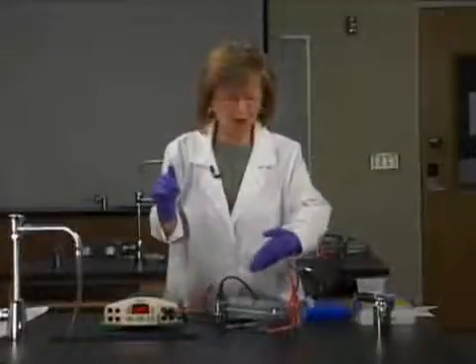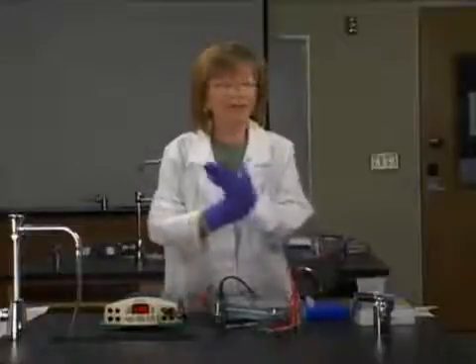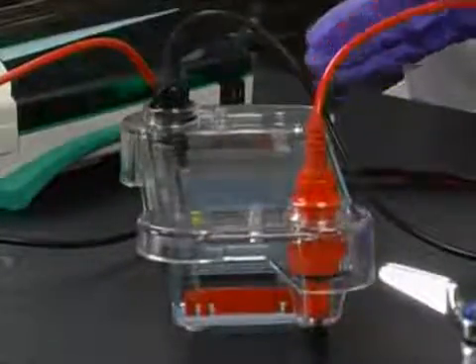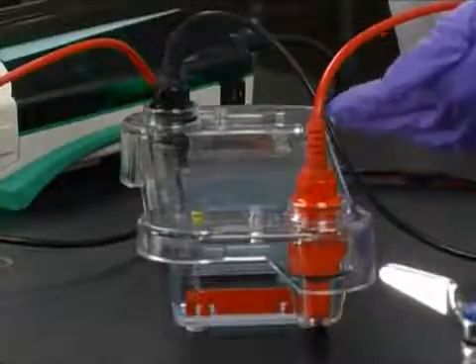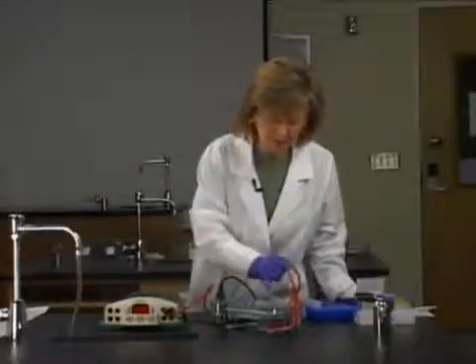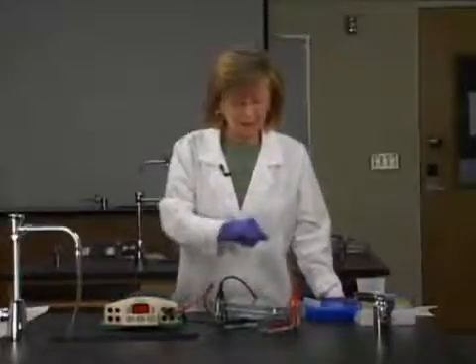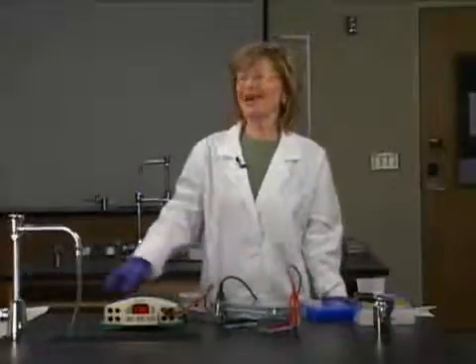Of course, the smaller fragments of DNA will migrate much more quickly through the gel, and they'll be closer to the end of the gel, whereas the larger fragments of DNA will not be able to migrate as far in the gel because of their mass or size. And when that's finished running, you'll see that a small band of bromophenol blue will be near the end of the gel. That's when we're going to turn it off, and then we're going to look at our bands on the light box.